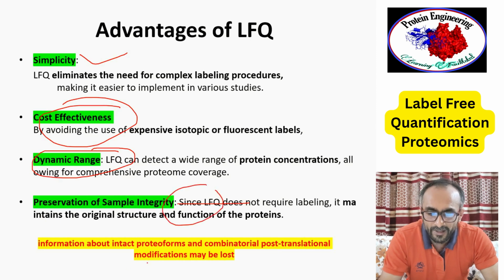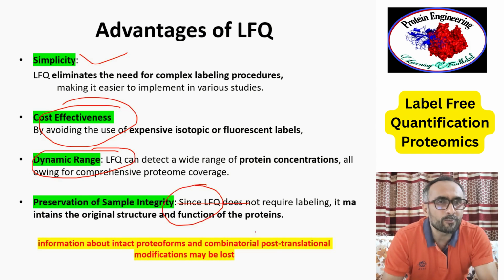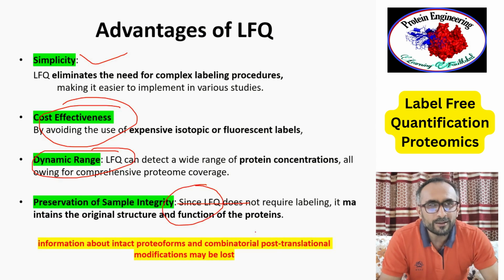But there is one drawback also. Proteins are not only peptides, there are also modifications present in the protein, and those modifications are lost when the protein is fragmented in LFQ for separation.